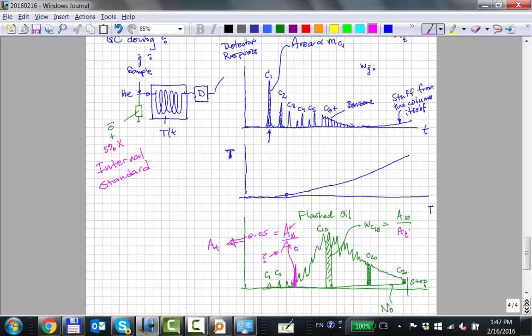What is the reason this baseline shows? Because you're going to high temperatures, and the material inside the column is made up of probably some organic stuff, and it just starts dislodging. You know, the hot helium brings some of it with it. So the detector is actually detecting something, but it's not what we put in as a sample.